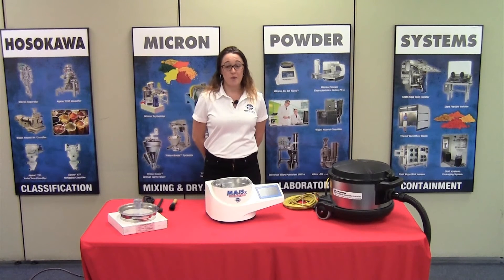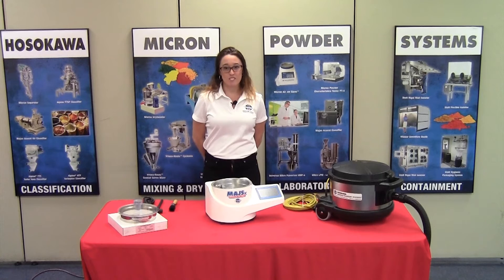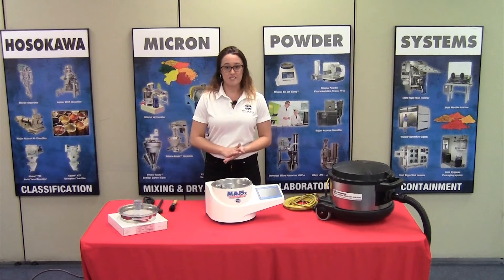My name is Leah Campbell and I'm a product specialist here at Hosokawa Micron Powder Systems in Summit, New Jersey. In this video, we're going to be discussing the setup of the Hosokawa Mikro Air Jet Sieve Model X in the basic version.